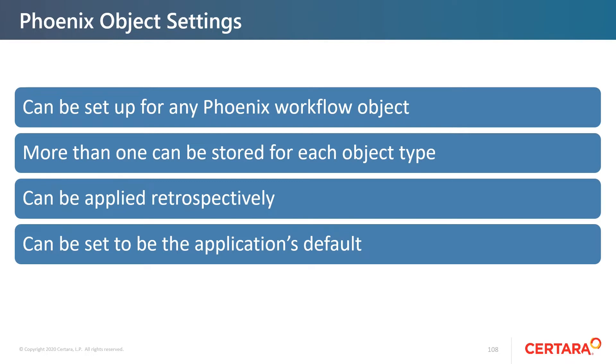They can also be applied retrospectively, by that I mean we can load up a template after we've initially created an object. They can also be set to be the application's default, which means you're changing how Phoenix is pre-configured to create plots or to run NCA.